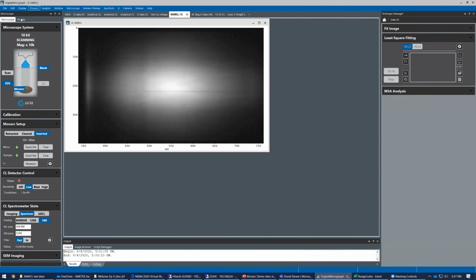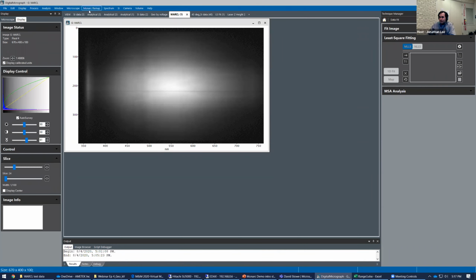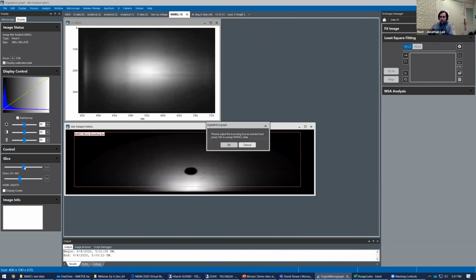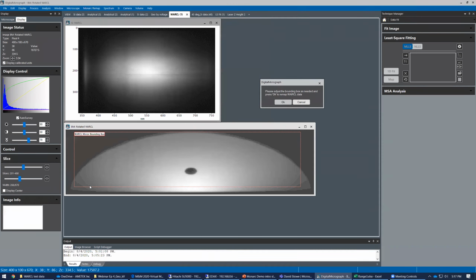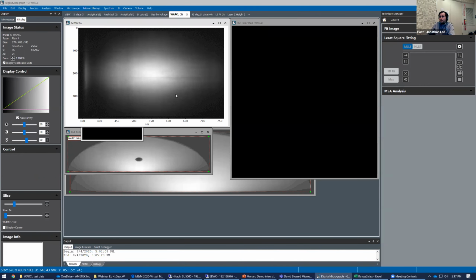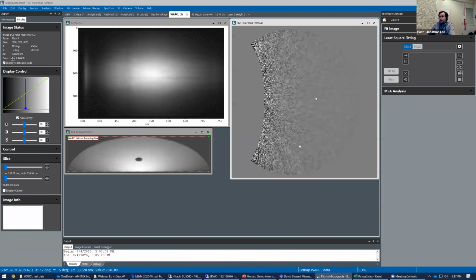Yeah. Fair enough. Thank you. Once I remap it, I think it'll speak to you a little bit more, because right now we're in the wavelength basis. But if I remap, this is the back plane of the parabolic mirror. This is basically what the instrument sees whenever you give it a bunch of light. And this hole is the aperture that the beam would travel down. Right now it's remapping.